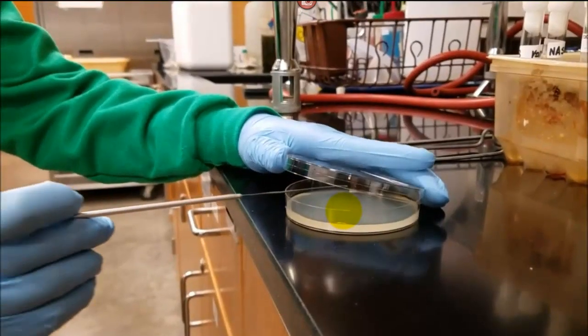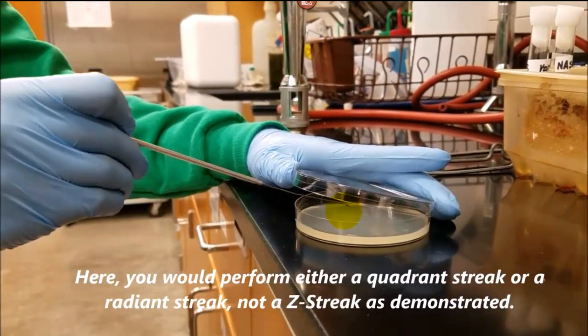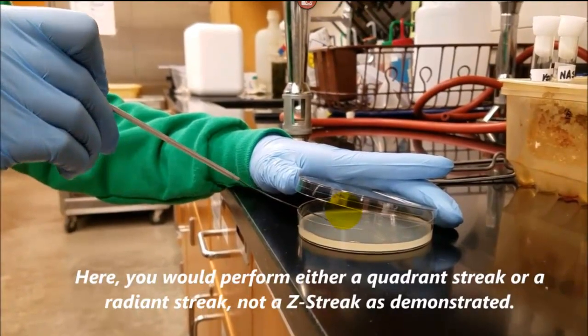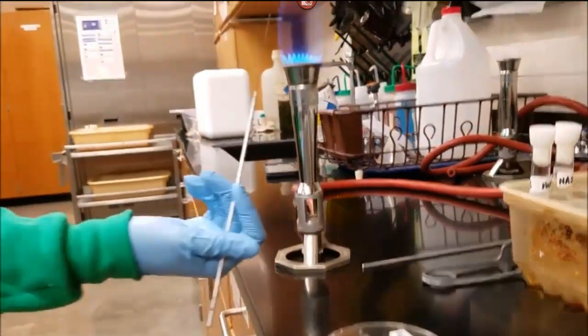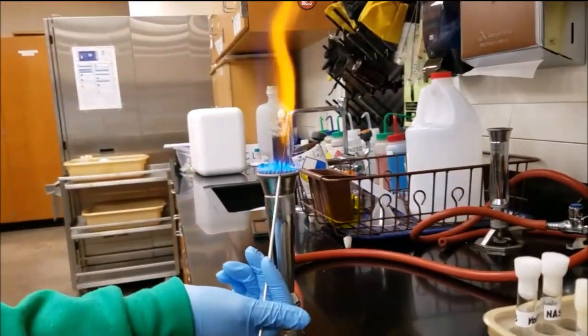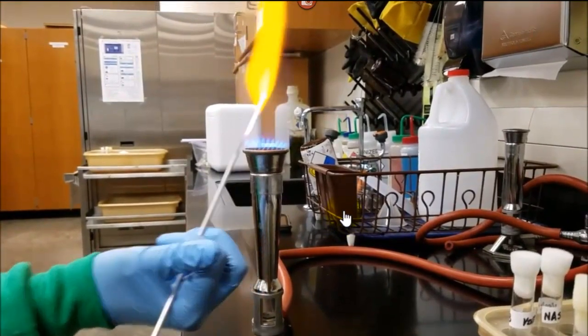And then now she's picking up the plate. Now that's one way to do it. And see, she's streaking. And in this case, it looks like she's doing a Z streak, but you can do that different ways. But the idea is you don't want to set the lid out on the table and leave the plate open for long periods of time because it will get contaminated.